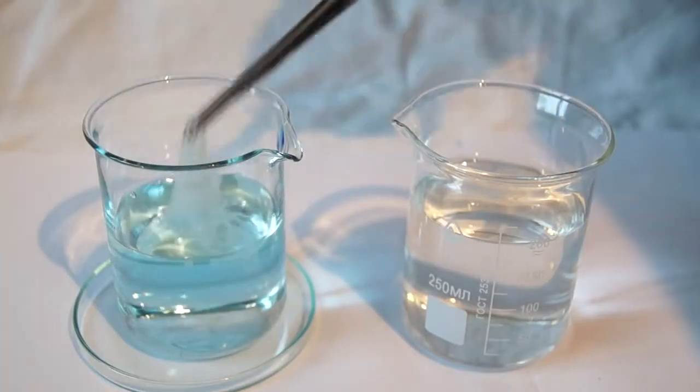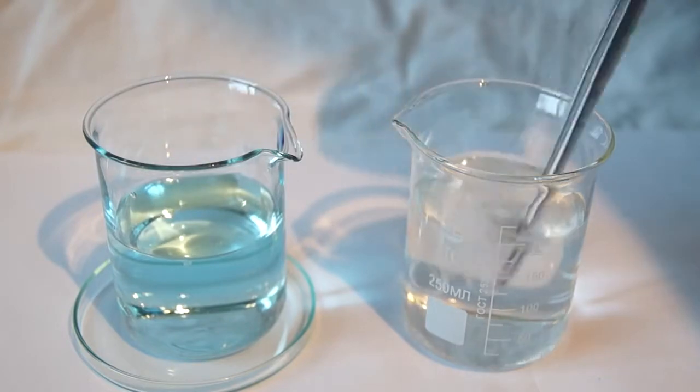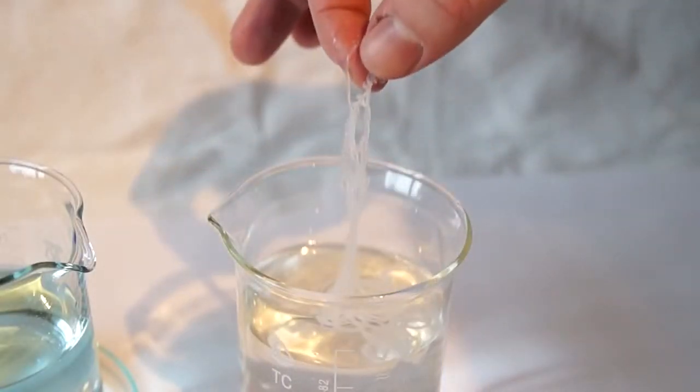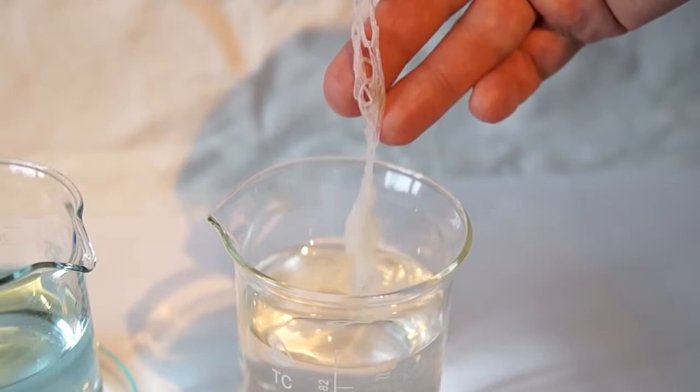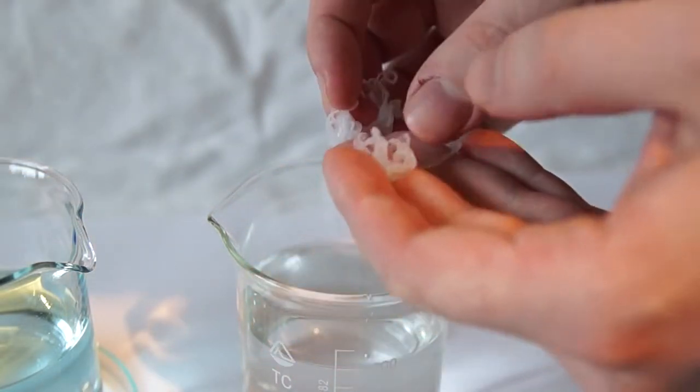After that, our fibers are bleached and now we can feel how they feel. To the touch, the fibers are very soft and they easily tear. This is due to the fact that I used a needle that was too thick.